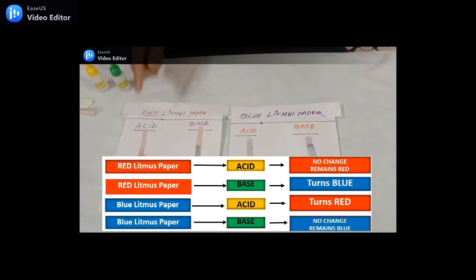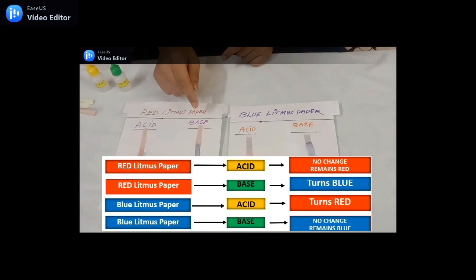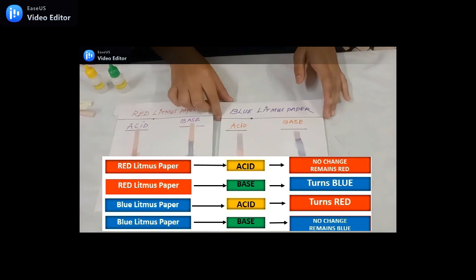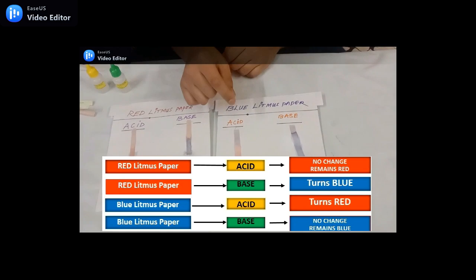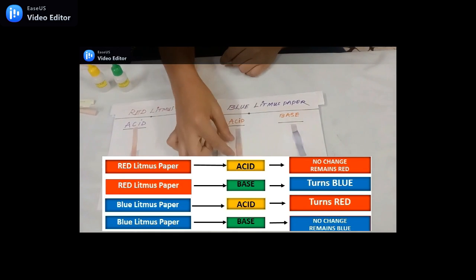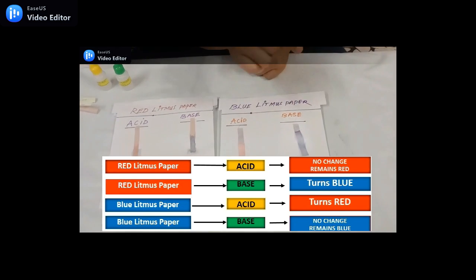The conclusion is: when we put acid on red litmus paper it remains red, but when we put base on red litmus paper it changes its color to blue. And when we put acid on blue litmus paper it changes its color to red.